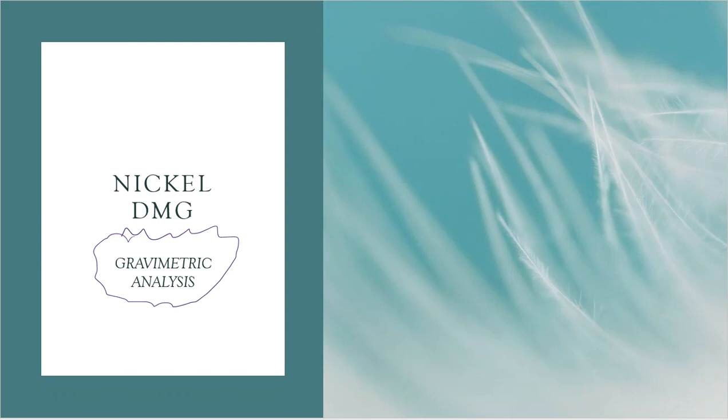Say I'm working in a laboratory or I'm applying for a job, and on the job application it says you need to be aware of gravimetric analysis techniques. What does that even mean? Well, gravimetric analysis basically means precipitate it and weigh it. That's it. That's all you got to do. It's just fancy terms that make us sound smart while we're working in a laboratory environment.